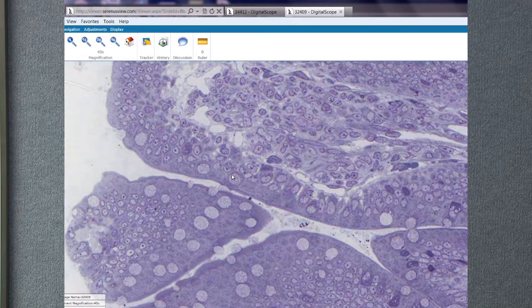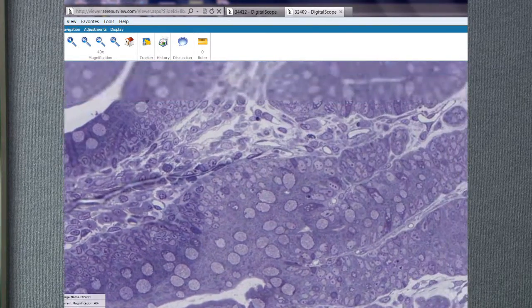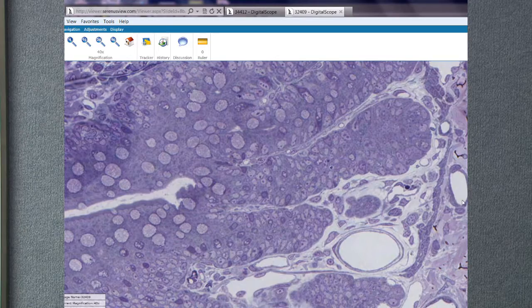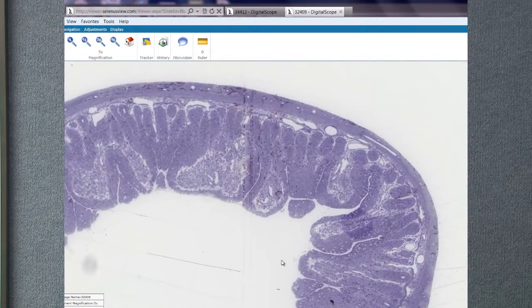You have to have a nice profile. Here you can see the columnar cells. This is one cell here, another cell there that we're seeing. And then if we go to another part, we can see the muscle. So this is smooth muscle in through there. This is nerve, and this is muscle in through here as well. So you can look at these specimens. These are blood vessels out through there, but this is a piece of gut that we can see.